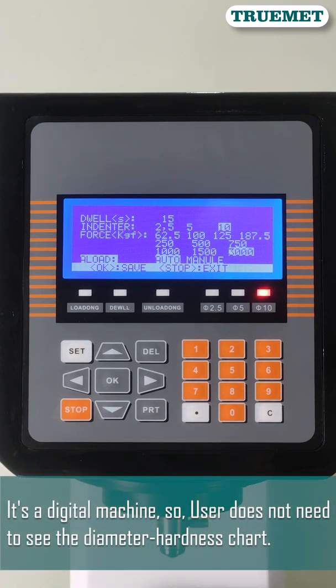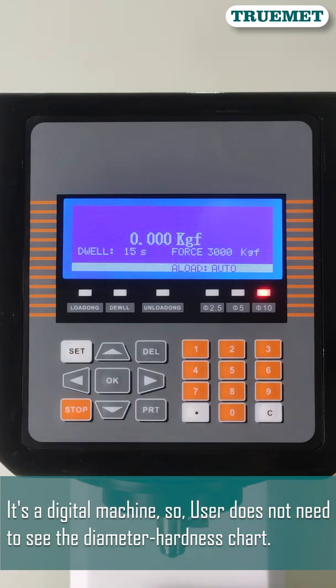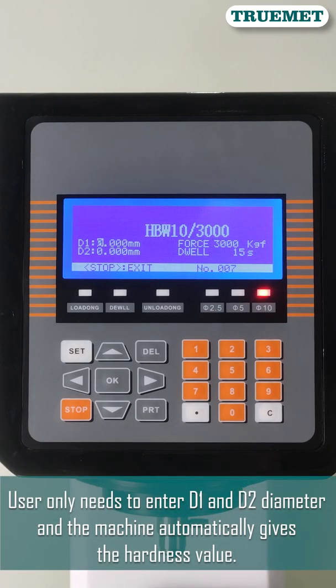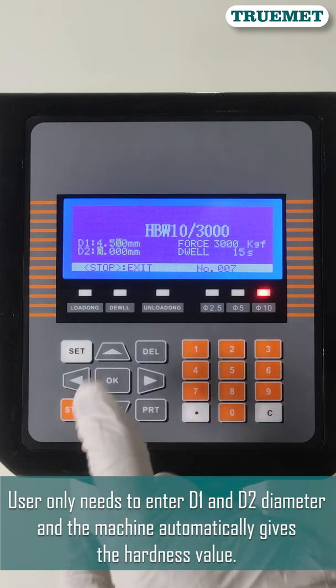It's a digital machine. The user does not need to refer to a diameter-hardness chart. The user only needs to enter the D1 and D2 diameter values, and the machine automatically gives the hardness value.